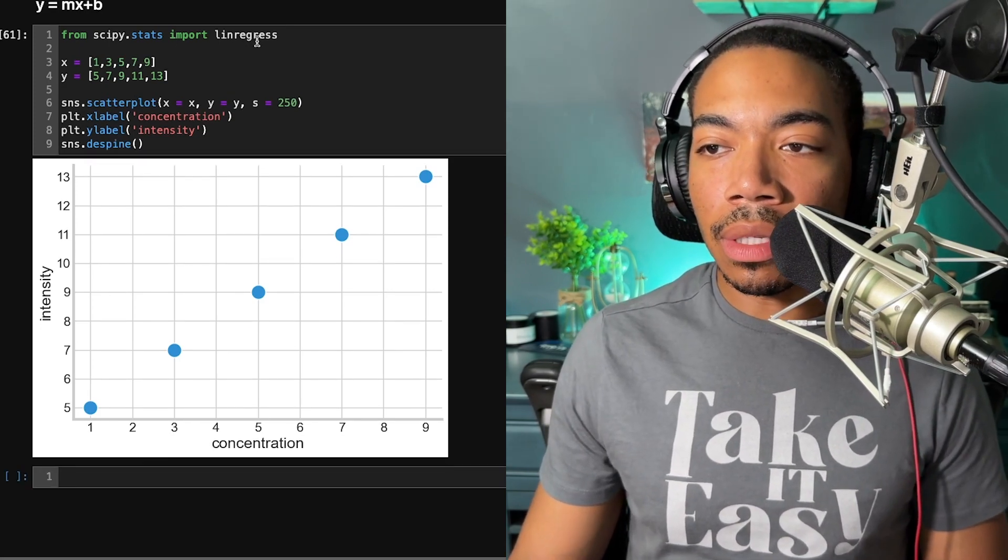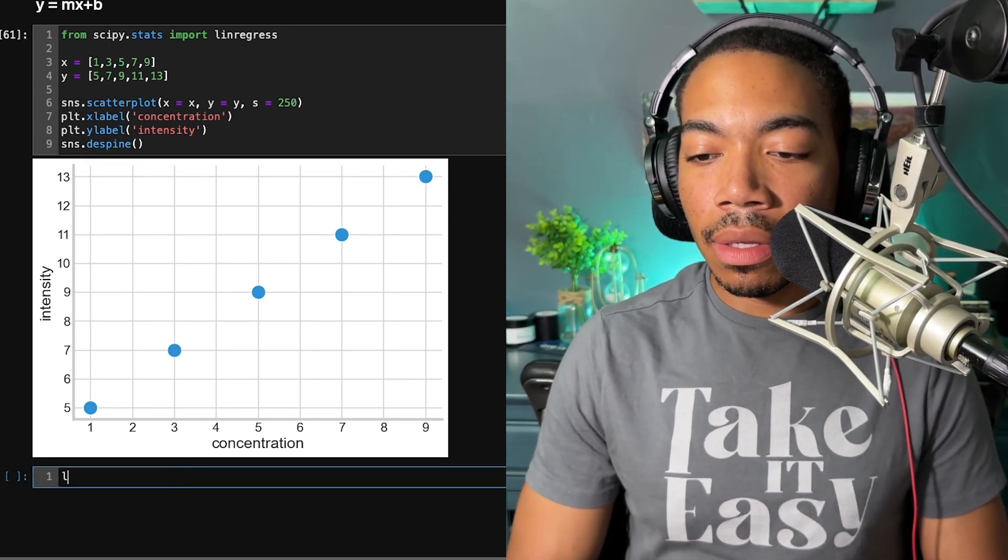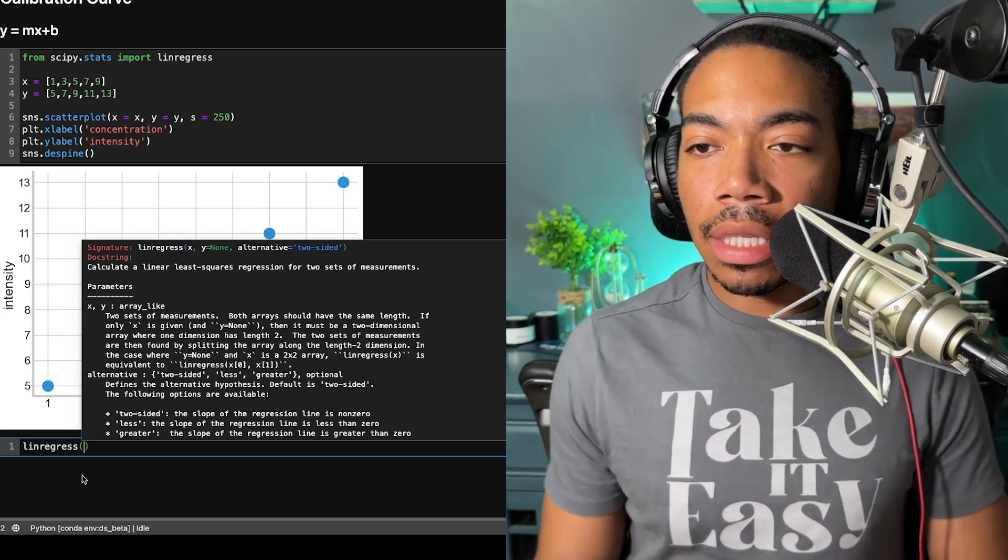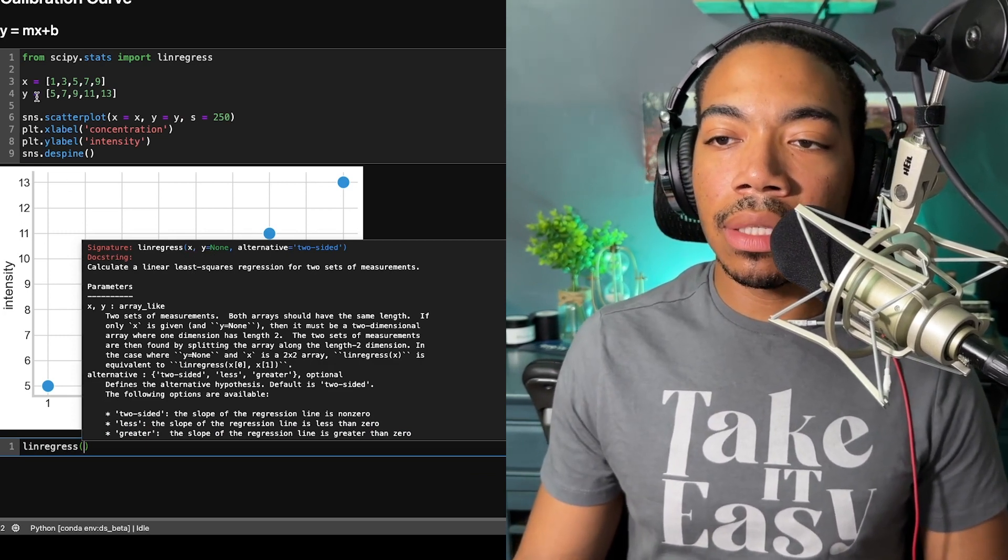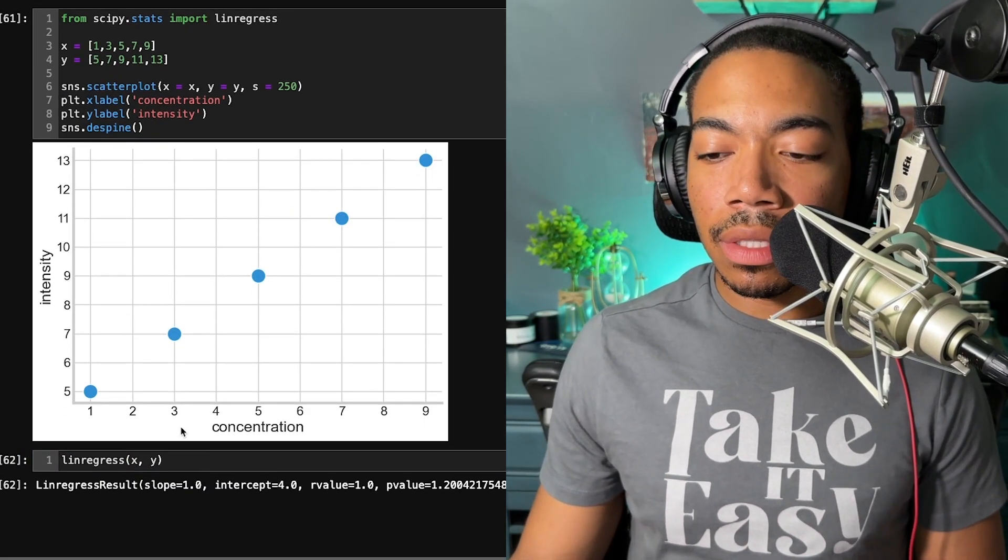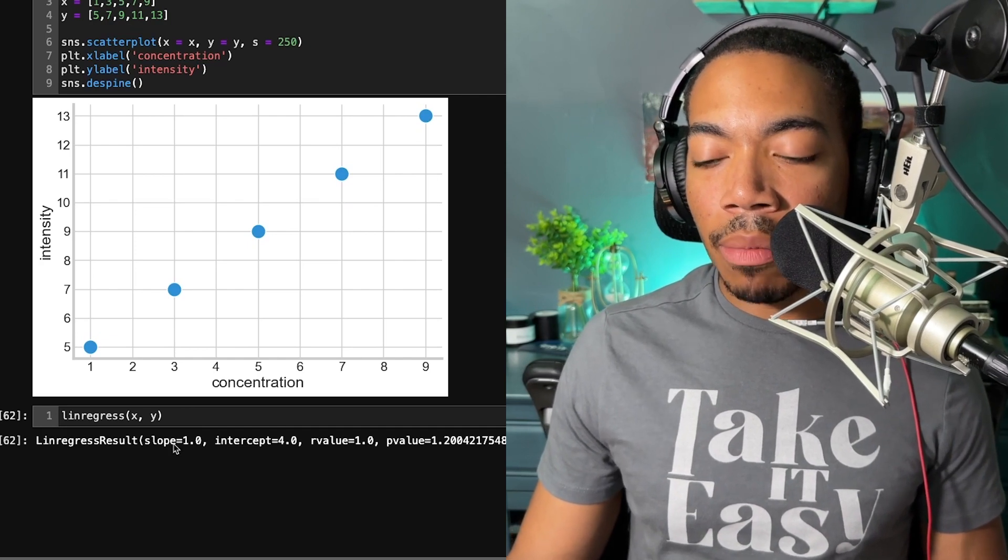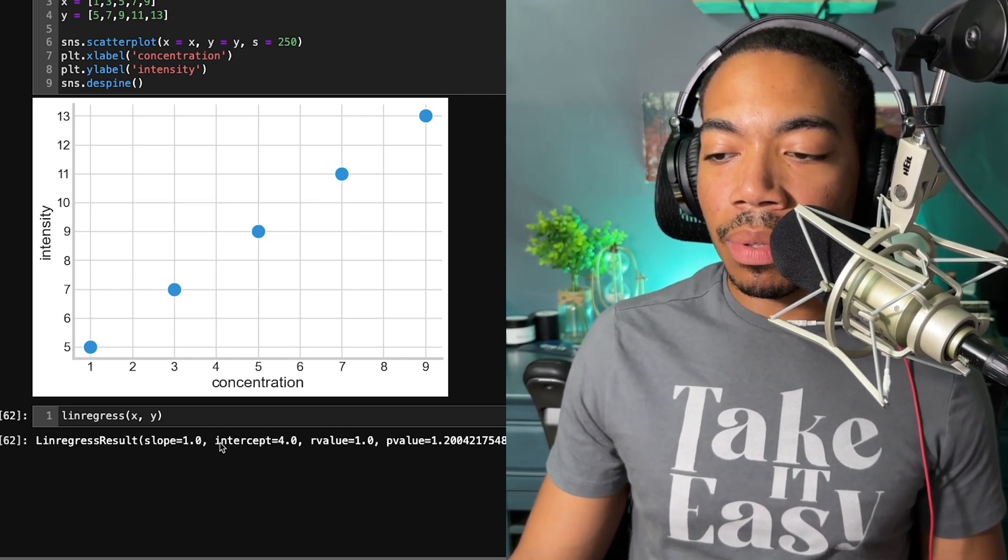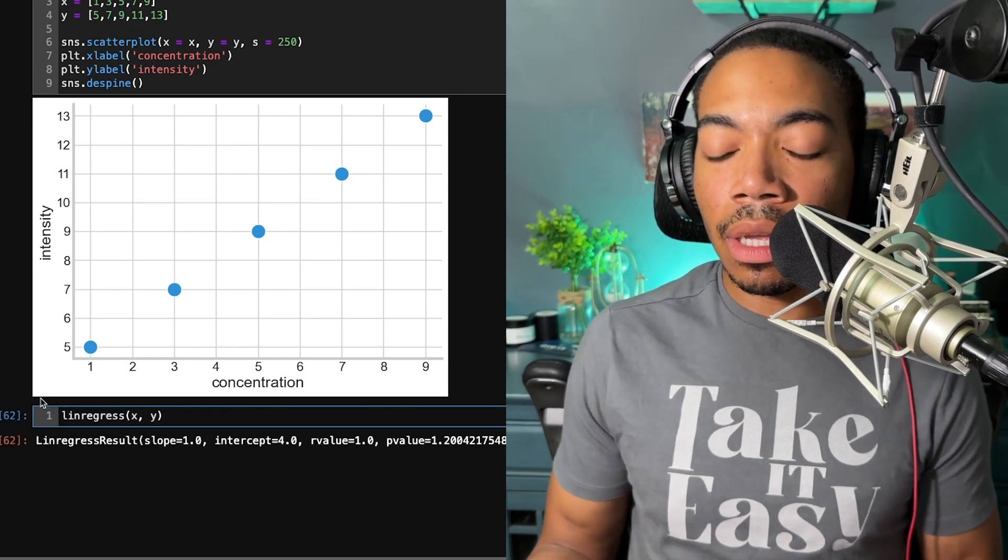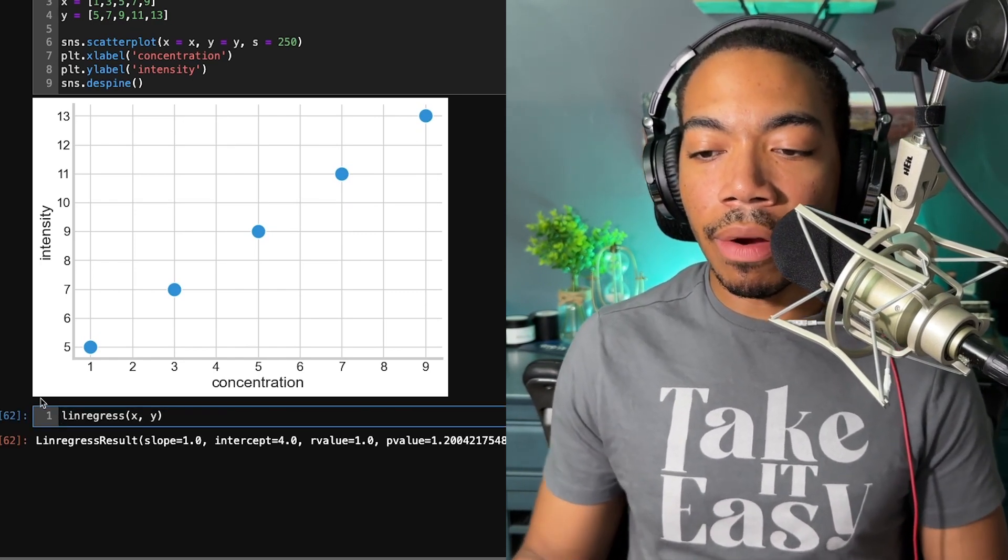So to begin, we're going to use this linregress method. And if you look inside, you see that it takes x and y. So in this case, our x would be our x list, our y would be our y list. And when we run this method, you see that we output multiple parameters, including the slope, the intercept, and several others. And so we can actually store these model outputs into their own variables.